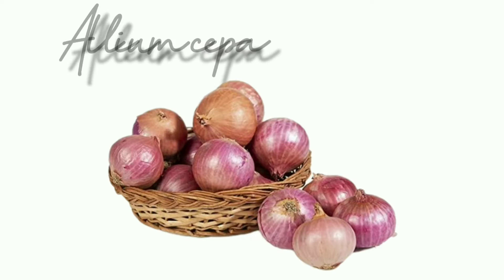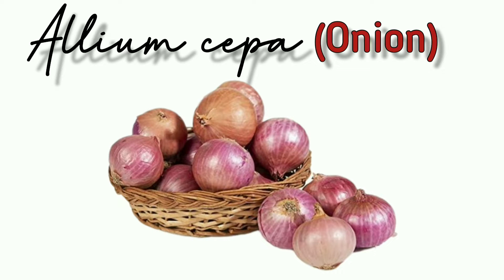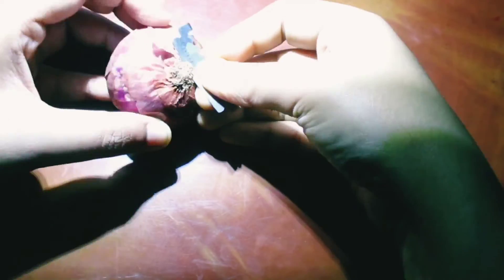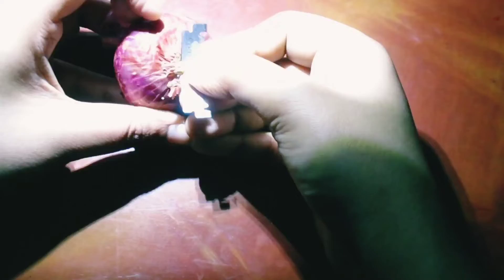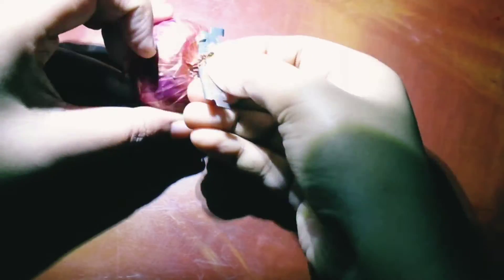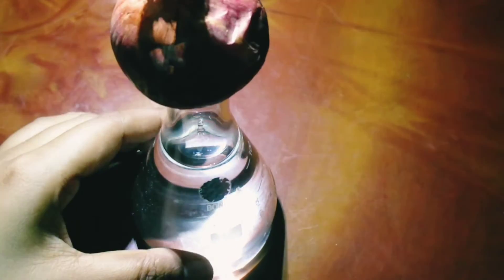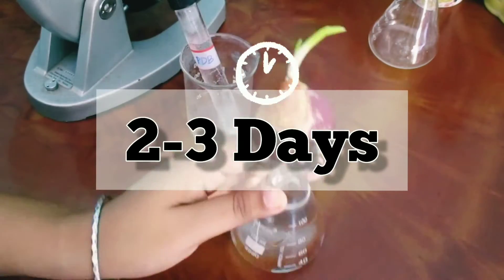Allium cepa, the onion, is supposed to be the most ideal material here. I took a bulb of onion. The outer surface of the disc is scraped with a blade to remove the remnants of old roots, and the bulb is placed in a conical flask with water. Within two or three days, roots come out.